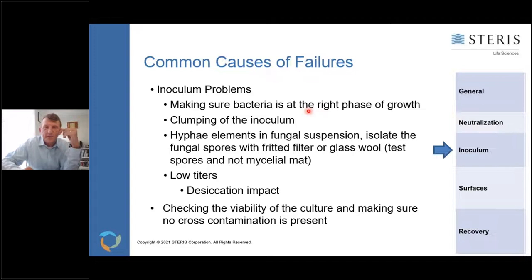You want to make sure your bacteria, for example, is in the right phase of growth. You don't want to incubate too long so it starts to go into a death phase. You want to make sure it's at that log phase somewhere, you know, 18 to 24 hours of growth. You want to look at your clumping of your inoculum when you're preparing your inoculum. Some microorganisms clump together and you don't want to test a biofilm or a big mat of spores or a big mat of fungi that you can't get access to with your disinfectant.